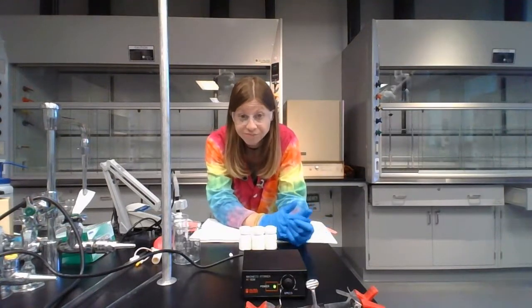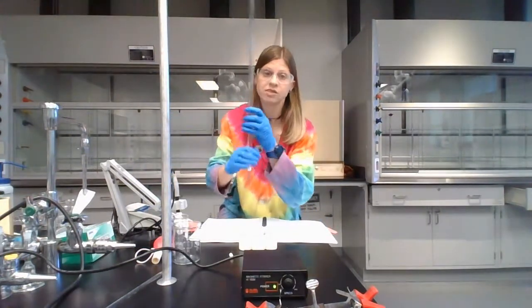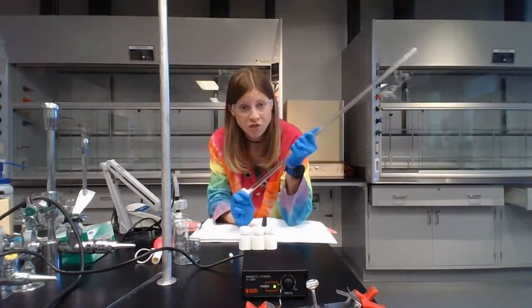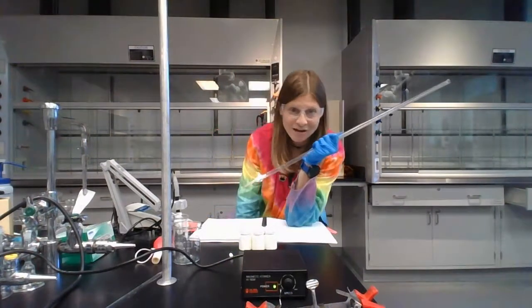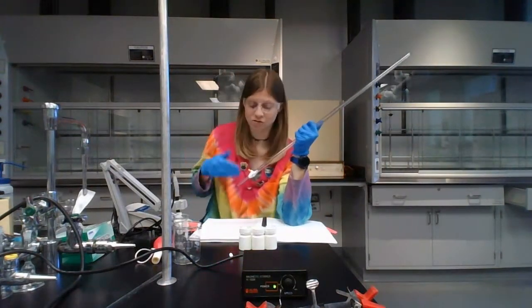So to get set up, your burette, which you'll be using for the titration, will need to be conditioned and then loaded with sodium hydroxide. The sodium hydroxide molarity will be given to you. If it is known at the time of the lab, it'll be written on the board. If it is not known at the exact time you do the experiment, it will be emailed to you or sent to you by your instructor when that information is known.